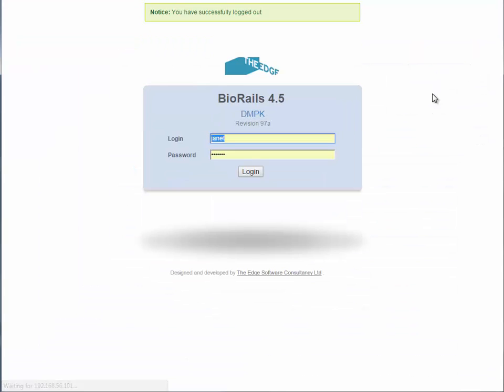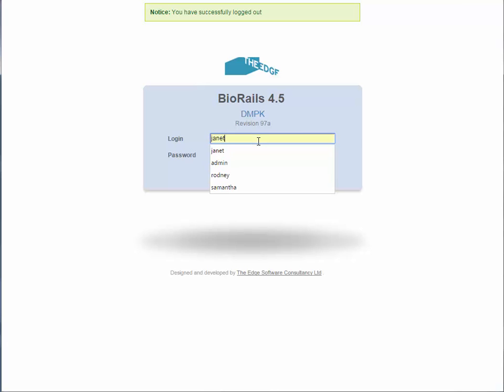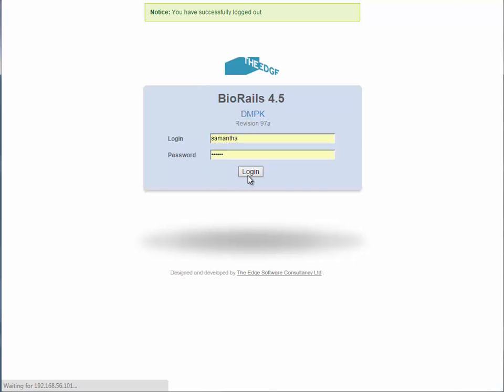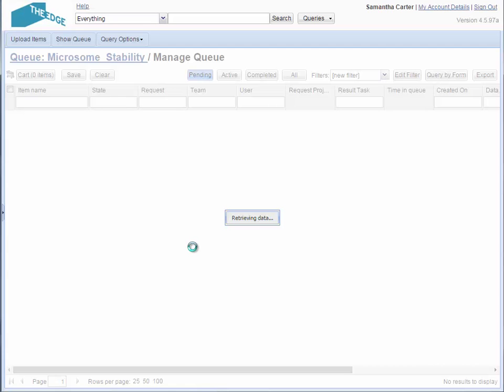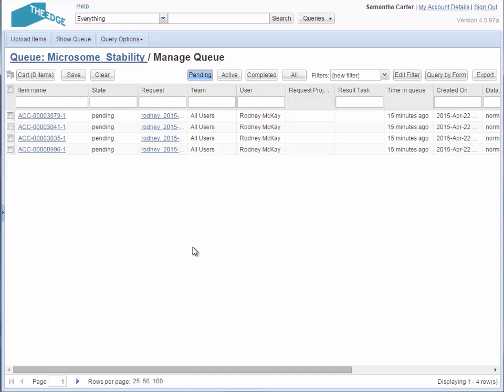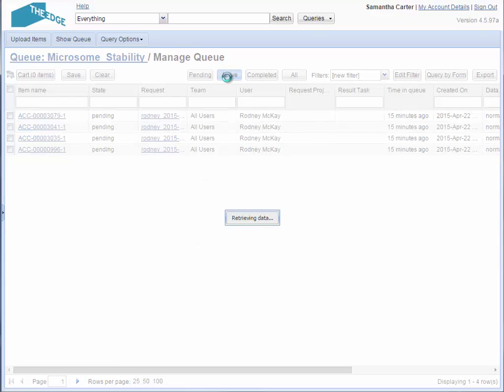I can now log out as Janet Fraser and log back in as Samantha Carter. She will be checking up on the progress of the assay. Managing the queue lets you check that the active samples are being worked on, and what results there are for them.